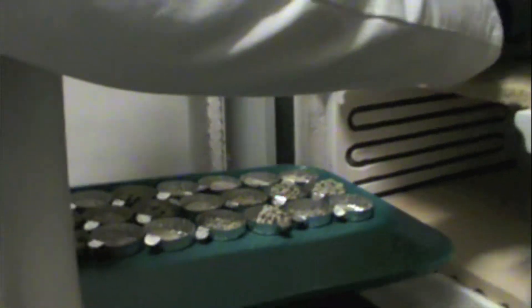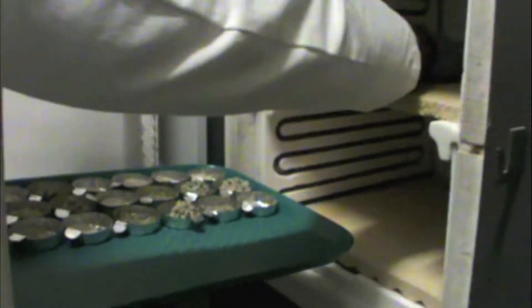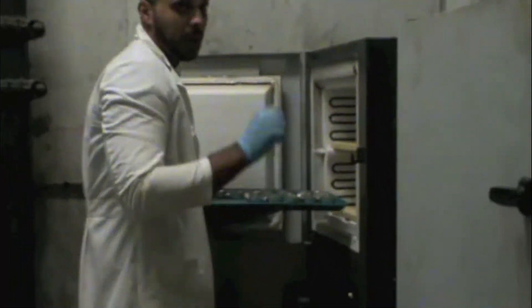Martin, do you know the max temperature that these ovens get to? For these samples we're doing right now, we're going to be putting this to 550 degrees Celsius, so you certainly do not want to be near it — which is extremely hot. Some of these could go higher than 550; I think this could go to 600. But you have that big one over there that we use for destroying the samples.